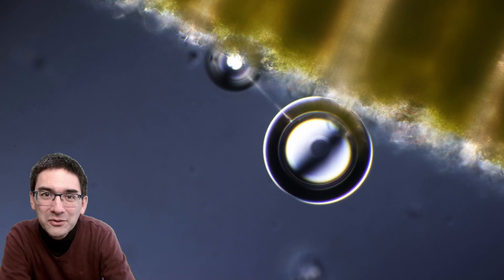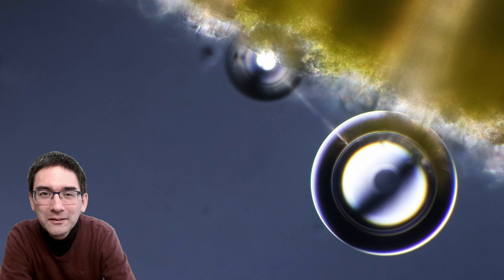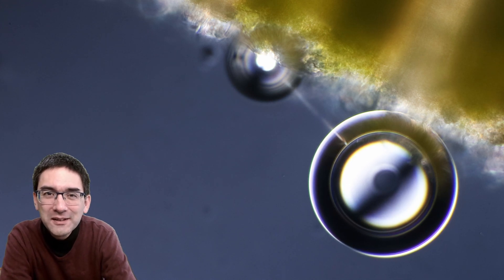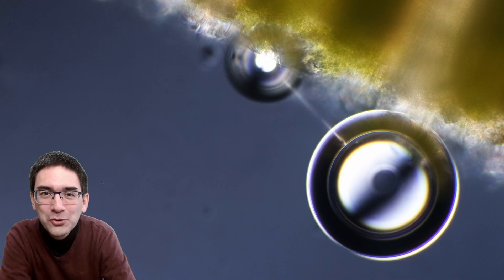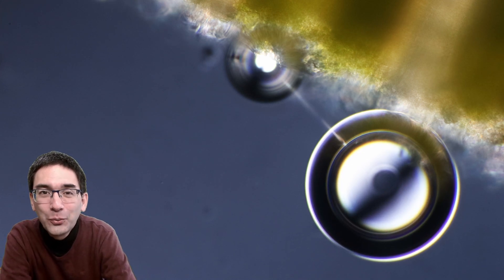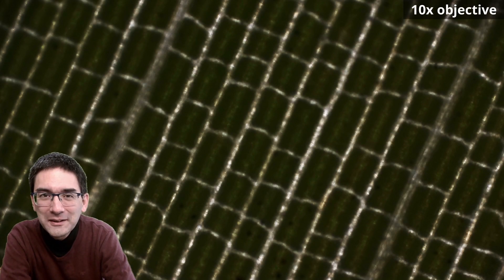I was also able to observe a little bit of photosynthesis. There was an oxygen bubble slowly growing — even this is time-lapse — which means that the leaf is still photosynthetically active. The oxygen that's produced is given off into the water and you can actually see the oxygen bubble grow, which looked quite nice.